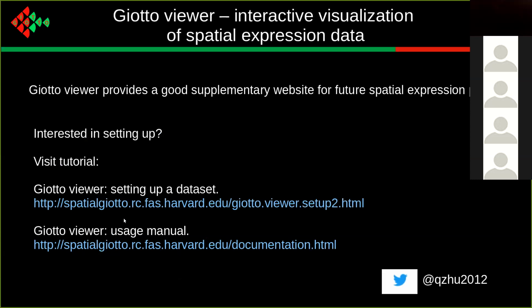So by now I have provided a demo of what Giotto Viewer can do. And we think that Giotto Viewer will provide a good supplementary website for future spatial expression projects. And if you're interested in setting Giotto Viewer up, you can visit the links provided here for details about setting up a data set or getting more details about the usage.